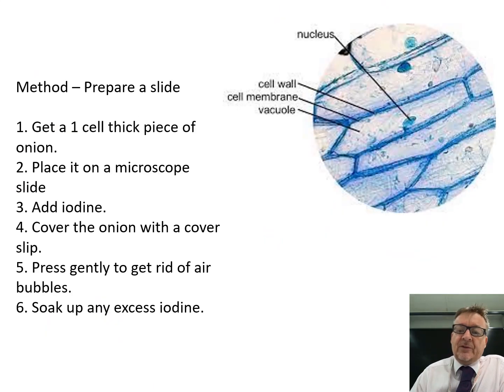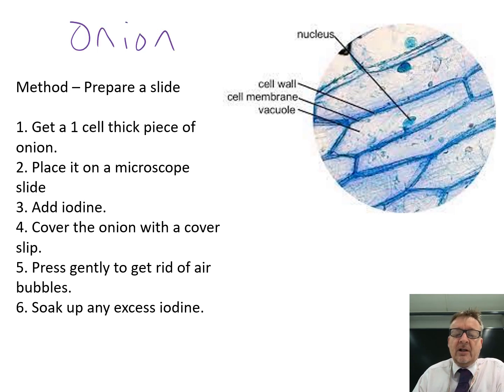Now you've worked out how to use the microscope, you need to prepare a slide using a standard method. Usually this is done with onions, because it's relatively easy to get a very thin piece.